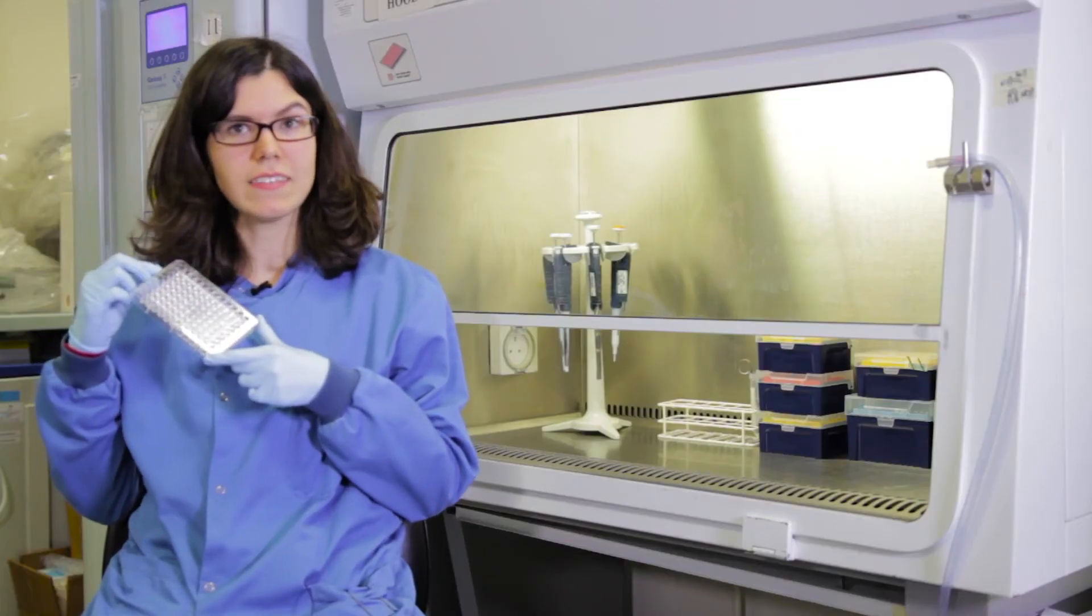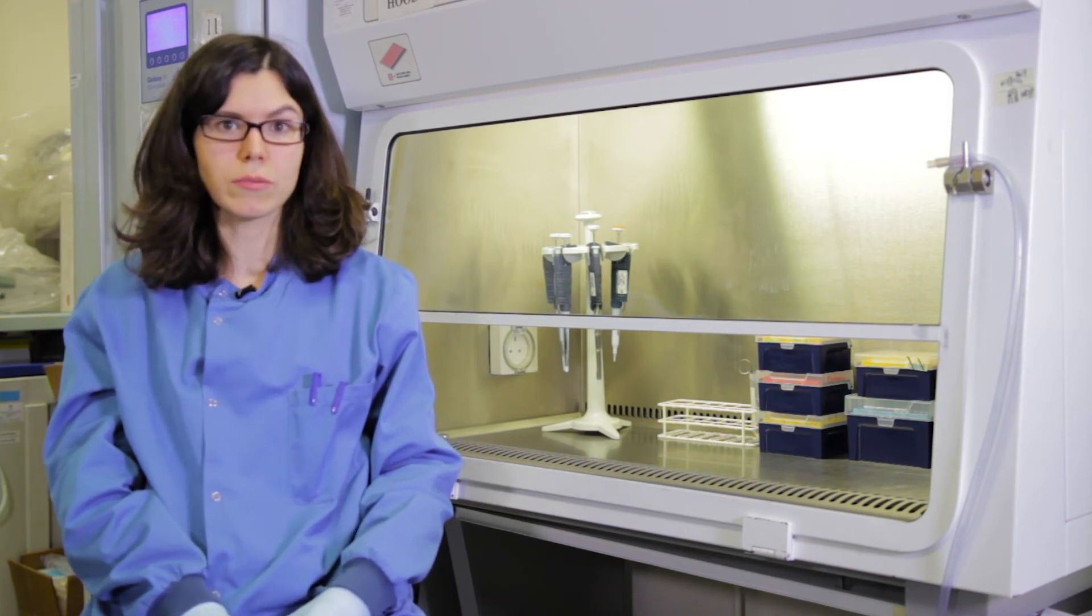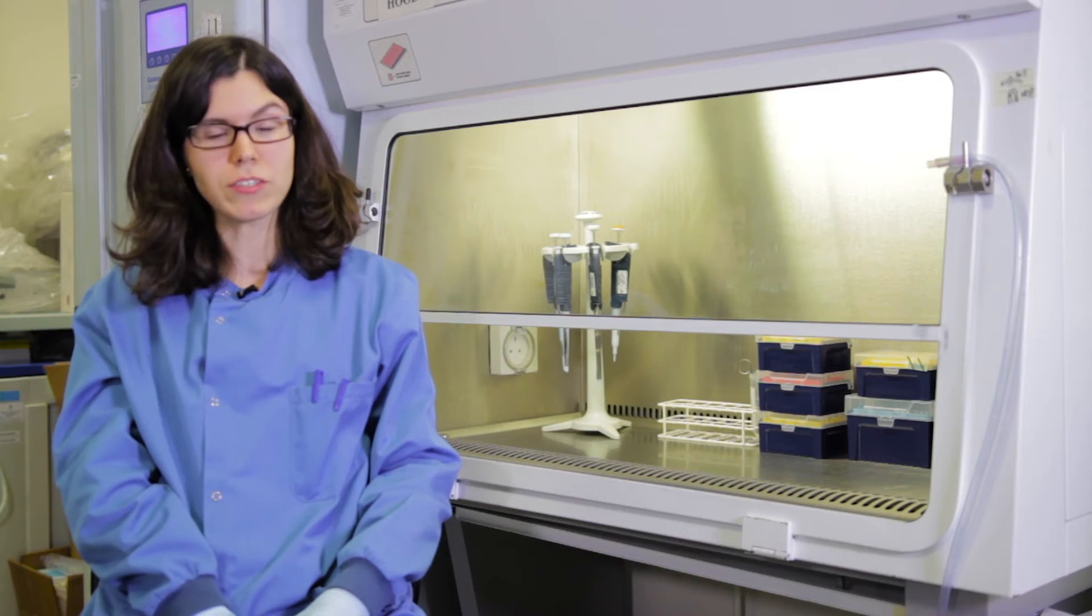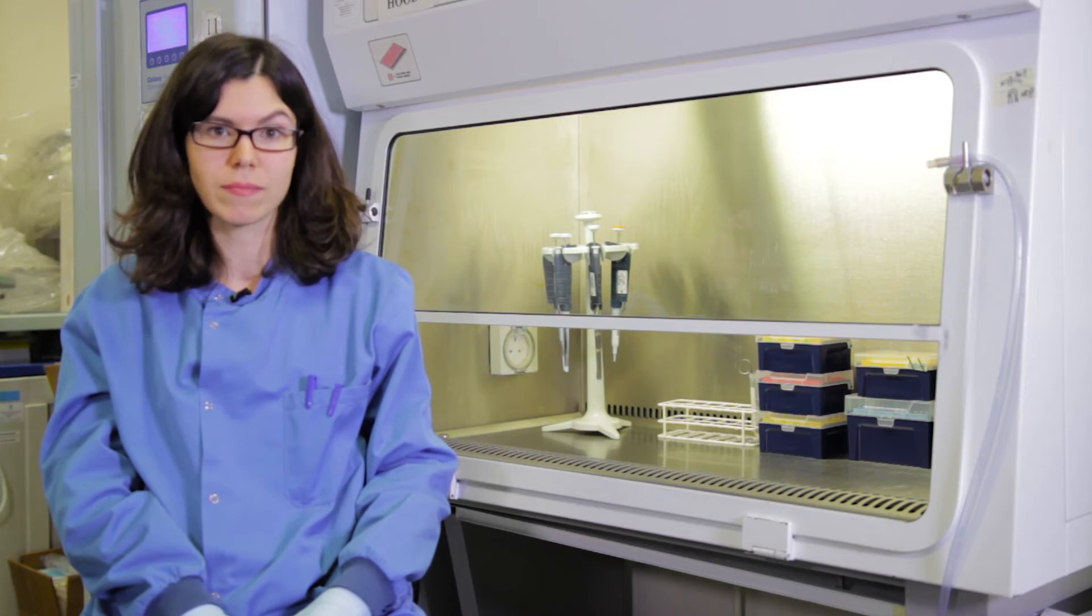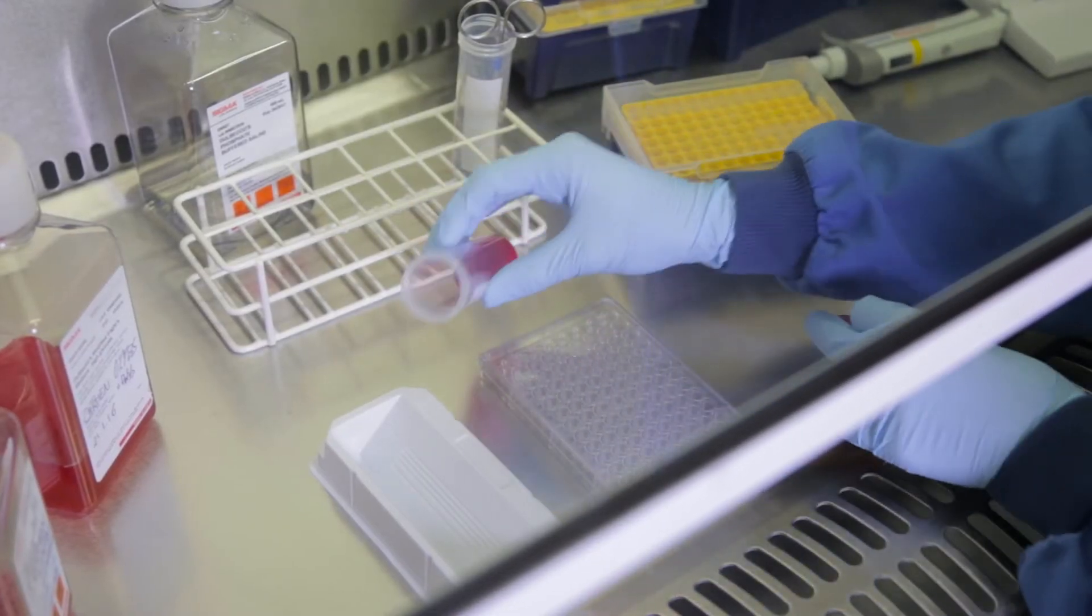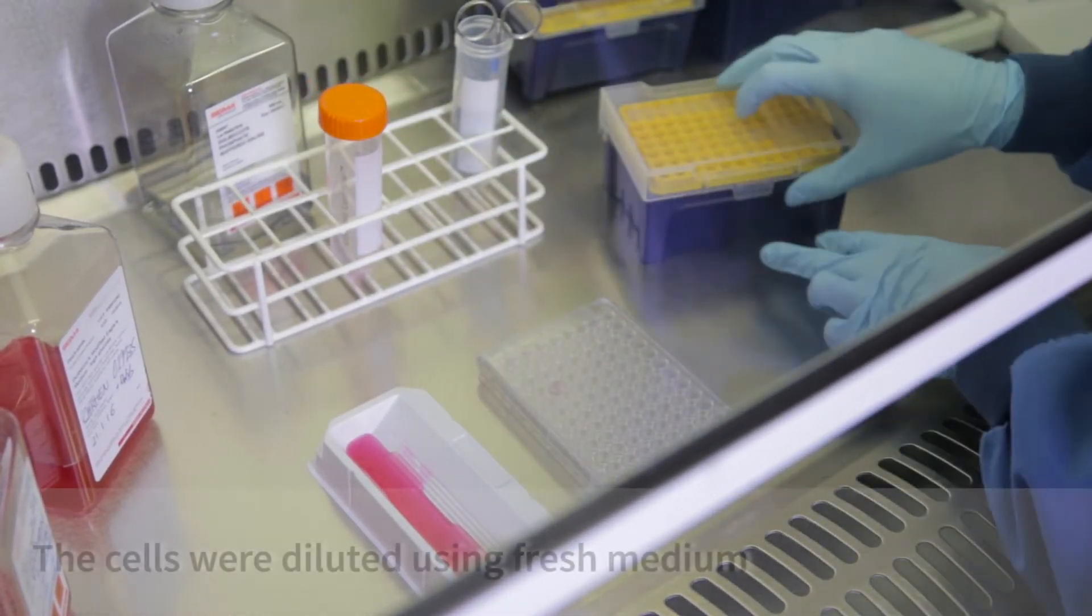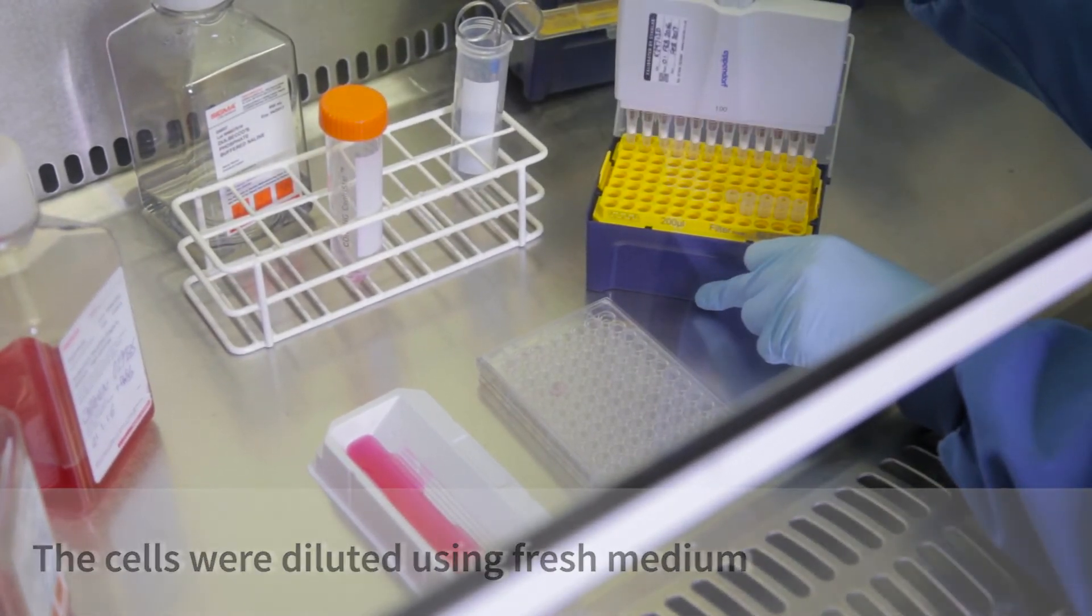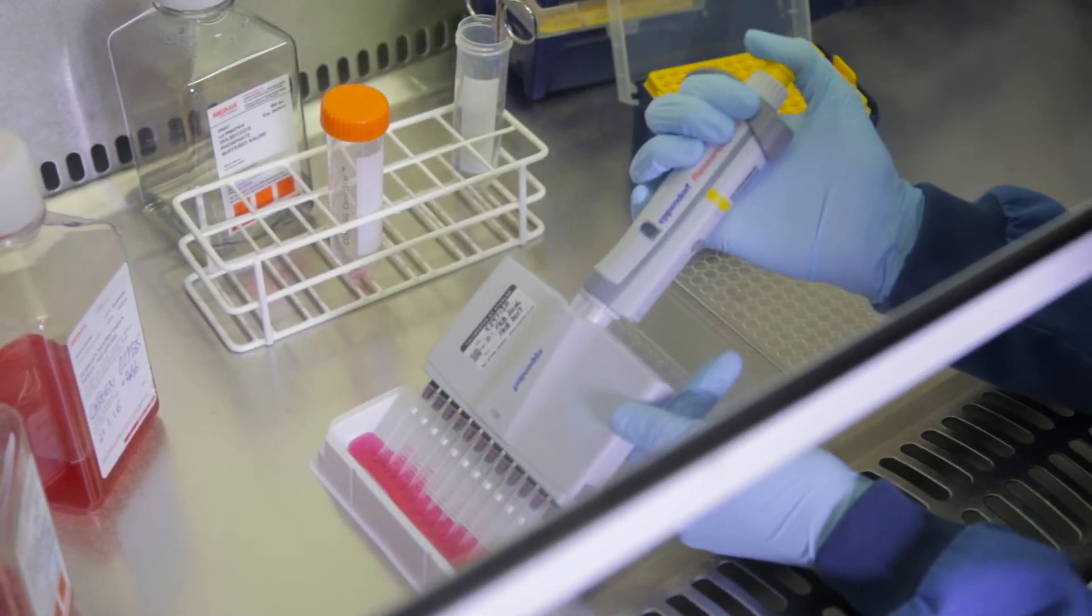This plate has 96 wells. I will now add a certain number of cells to each well. That is called seeding. I use this plate because it allows me to try many different treatment conditions at once. I will add a different treatment to each well. I normally seed 10,000 cells per well. I have diluted the cells to the desired concentration and volume using fresh medium.